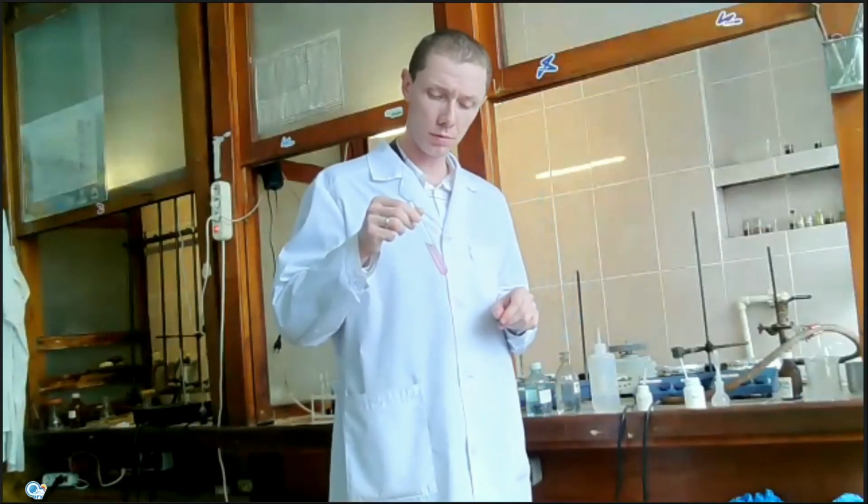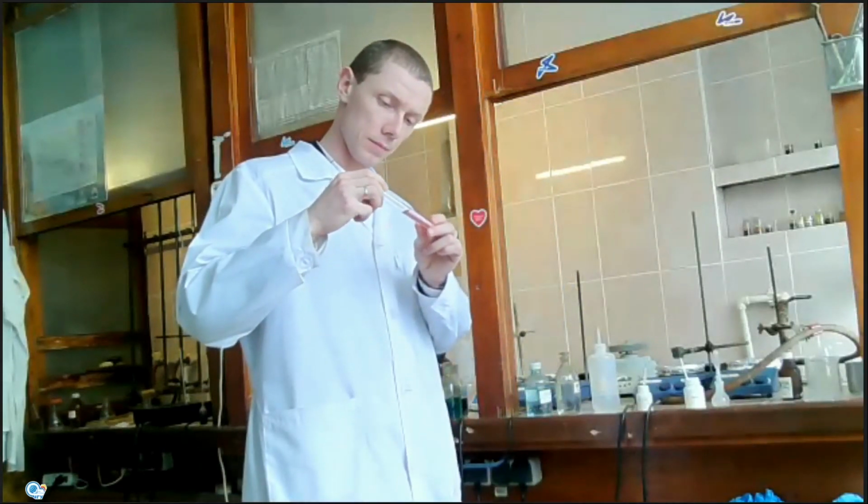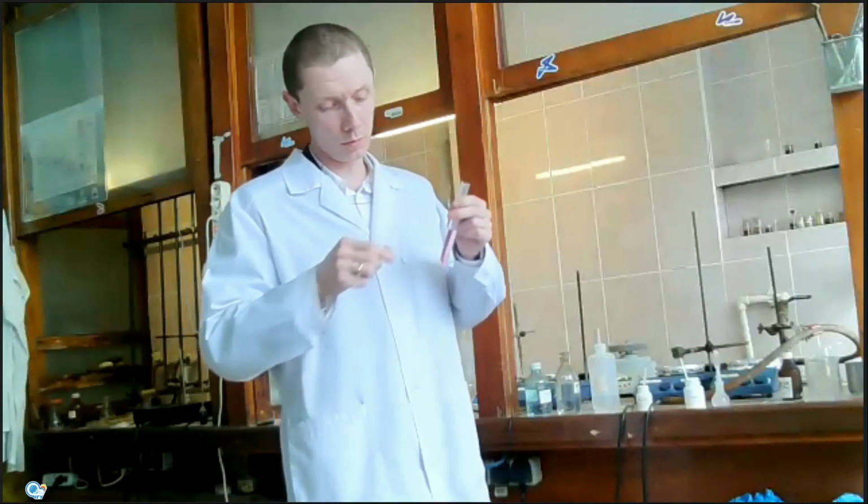Because the reaction of cobalt salt with hydrochloric acid is also reversible, when you dissolve this, then you add water, this reaction goes backward, and aqua complex of cobalt was formed.